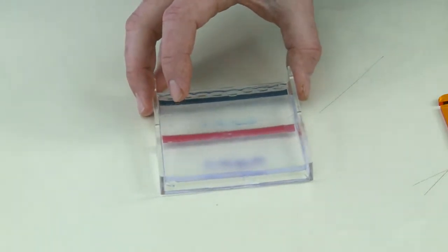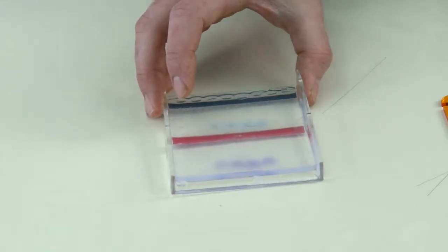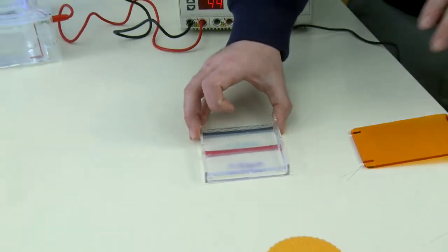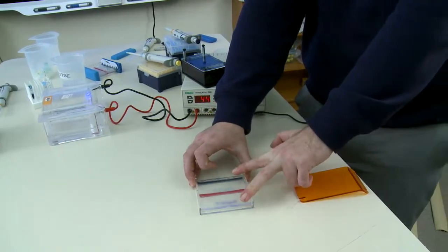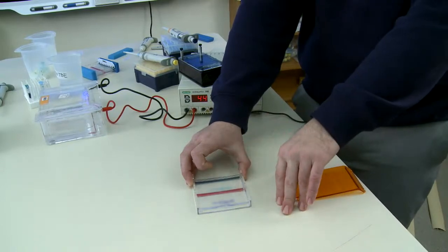And so the dye that I put into our tubes actually had 2 different components to it. One that runs a little bit faster, or a lot faster, I should say, than the other. That's that purple one down there. And then there's one that runs a little bit slower. That's that blue one up there. And that just basically tells you that the gel went for a certain amount of distance, or a certain amount of time, I should say.